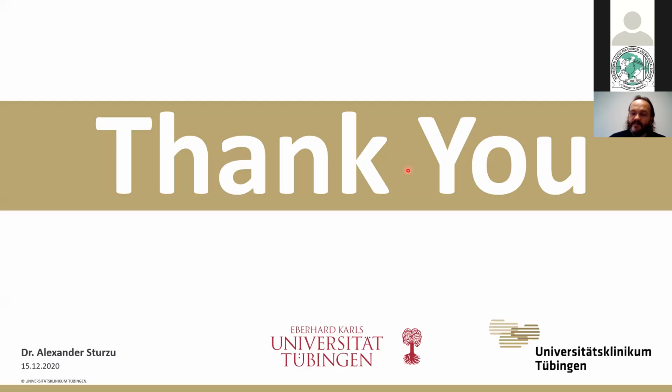Okay, thank you so much. If I'm not mistaken, then MTT is by quite a big margin cheaper. So if you have the cost factor, then it is much more beneficial to keep using the MTT and just do this additional step in the detection.